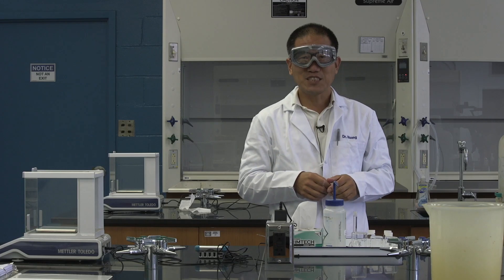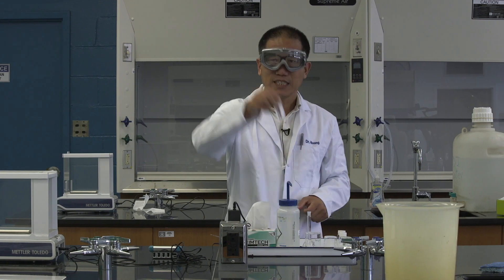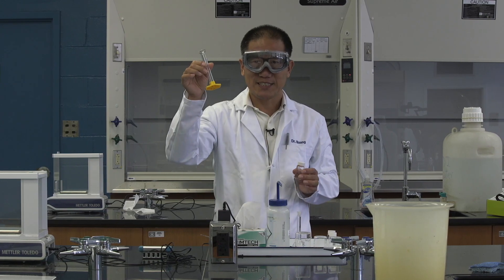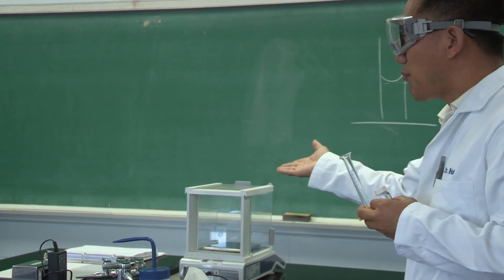Although this doesn't look very pretty, but it's safe. The first part of the experiment is trying to determine the density of an unknown liquid, which is in this bottle. It should be in your dish. With a graduated cylinder and an electronic balance.